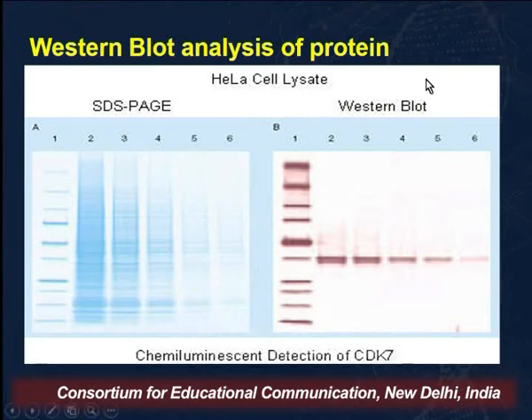or under different conditions. For example, we use a normal cell and a diseased cell. It could be any kind of disease, a muscle wasting disease. So we take a normal muscle tissue, and a tissue from a person who is suffering from, say, muscular dystrophy. So we take that protein. When we use the proteins, we prepare a total lysate, and we add a particular protein that we want to identify. For example, say TNF alpha, which is a cytokine, or TWEAK, which is a TNF-like weak inducer of apoptosis.